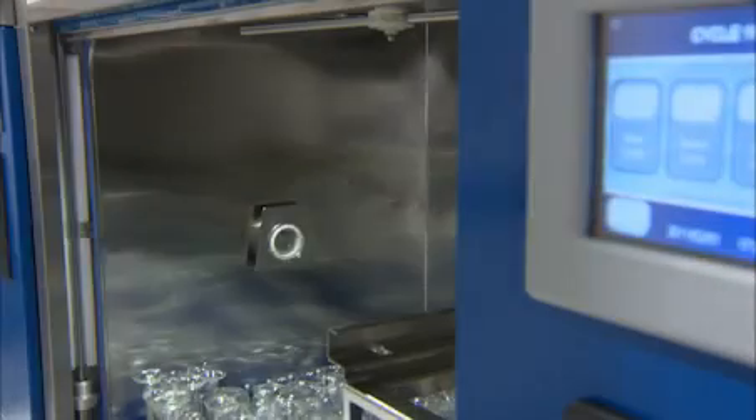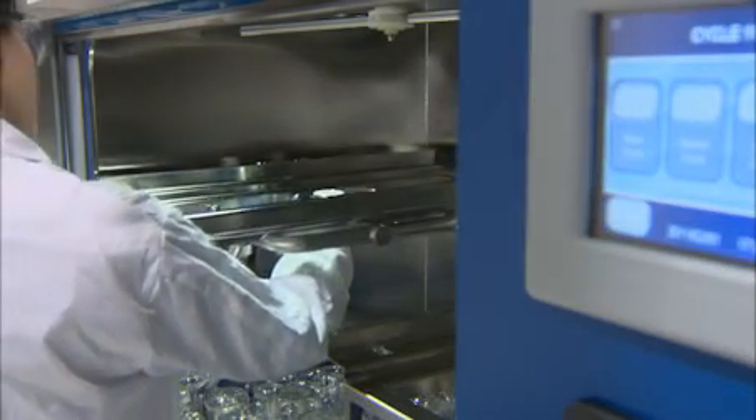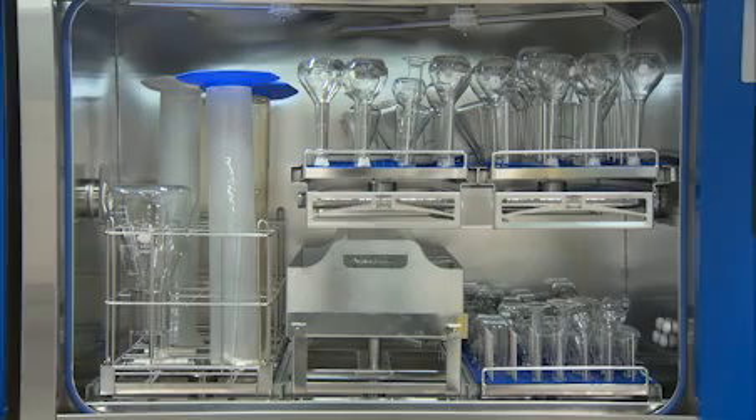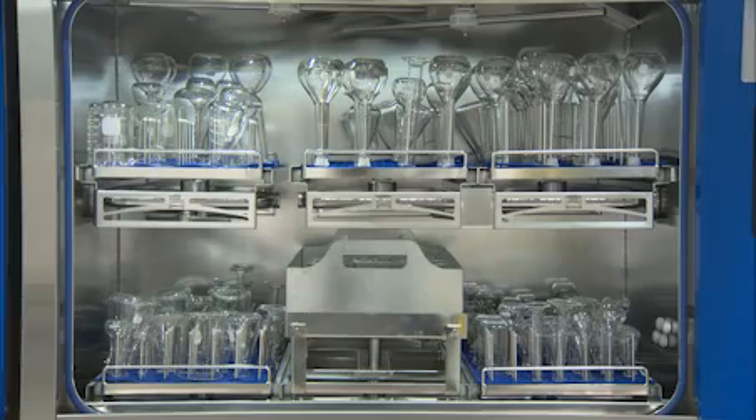The XLS series is designed with flexibility in mind. The unique accessory loading system can accommodate four to six different independent and easy-to-handle accessories.